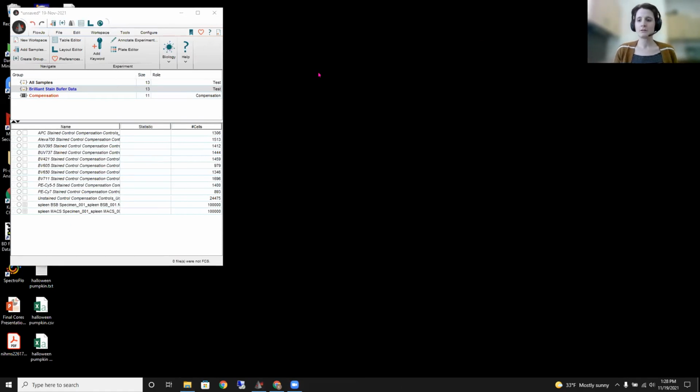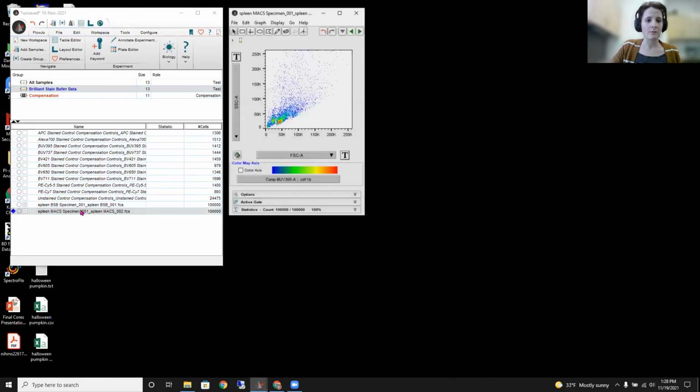What I'd like to do is show you what happens when we stain in our normal FACS buffer, and compare that to what the data looks like when we actually use the correct staining buffer. So if we open up and start looking at our data files from when we stained in a regular buffer that didn't account for this polymer interaction, let's see what it looks like.